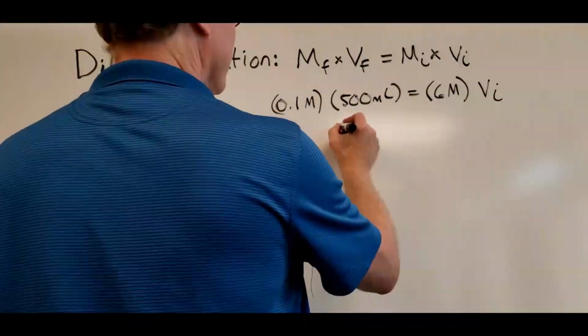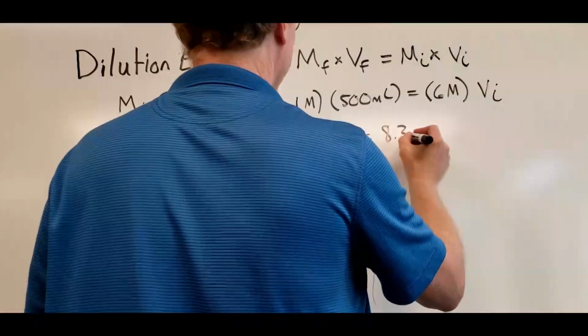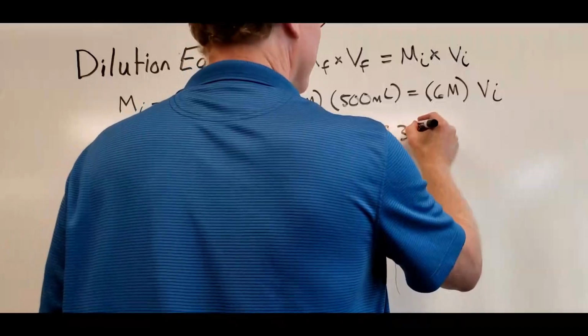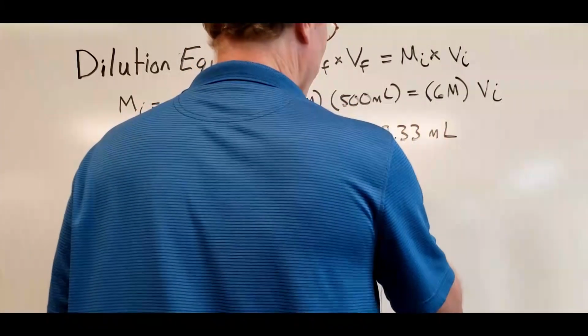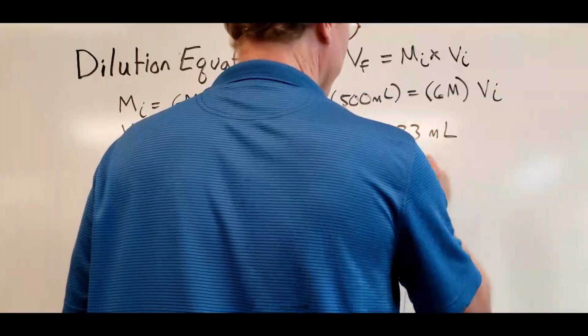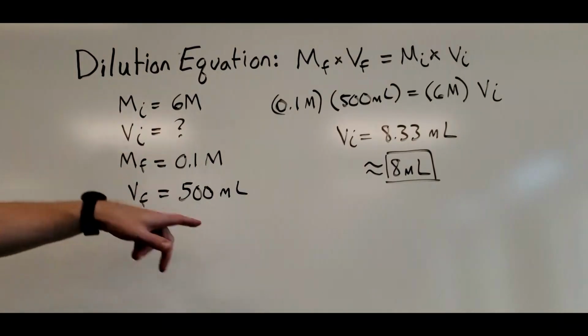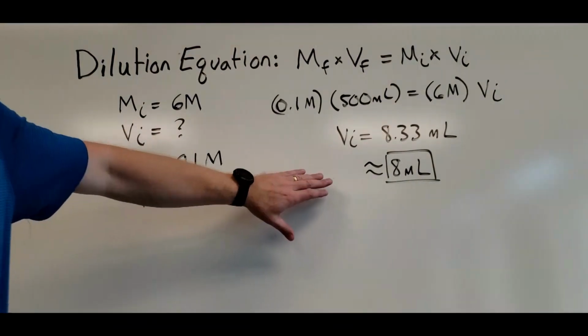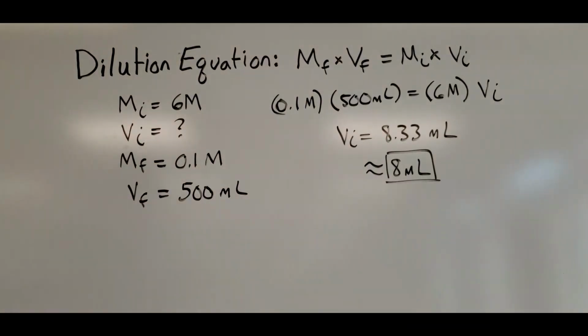Okay, and just to cut to the chase, when we do it really quickly here, what we want is approximately 8 mils that we're going to add in of the 6 molar sodium hydroxide. We don't have to be any more precise than that, and we'll see why in the next few steps.